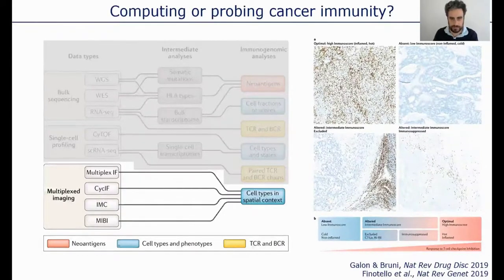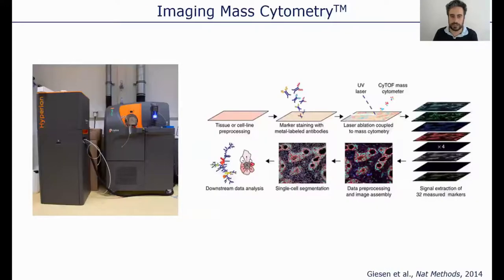Several groups, for instance Jérôme Galon with Immunoscore, have now demonstrated that different tumors can carry the same amount of T-cells, for instance, but their differential localization can have profound clinical implications which would not be picked up by a method that ignores spatial context. We are therefore very lucky that we can make use of an imaging mass cytometry instrument at LMC, where the parallel detection of several antigens can be done simultaneously by making use of heavy metal labeled antibodies.